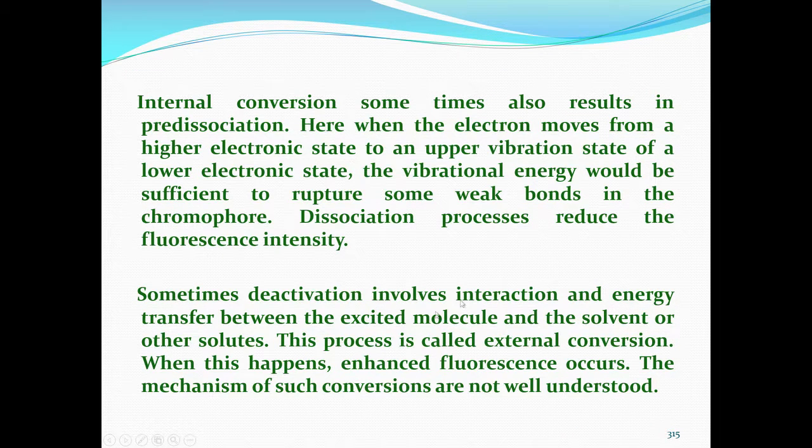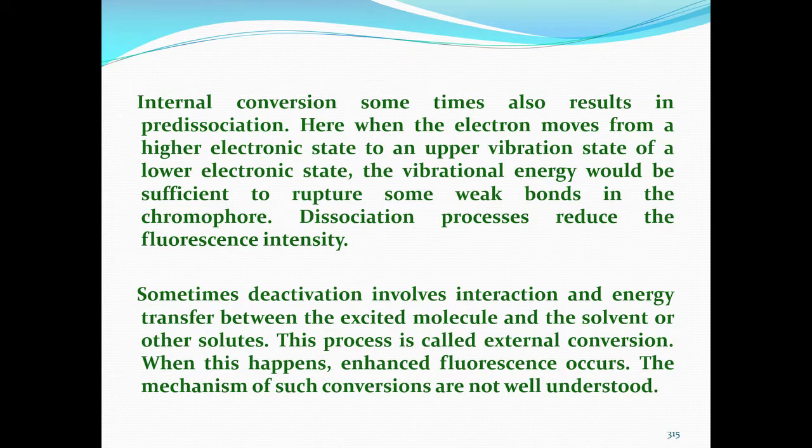So, sometimes this deactivation we talked of so far also involves interaction and energy transfer between the excited molecule and the solvent molecules. The solvent can be an aqueous solution, the water molecules, or it may be some other solute, it may be organic solvents like butanol, benzene, toluene, xylene, etc. So, the solute molecules, solvent molecules also can contribute to this deactivation.